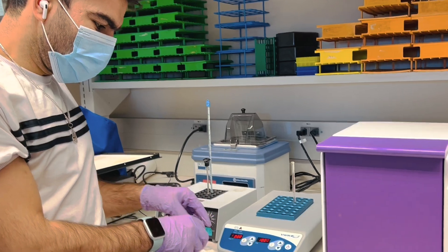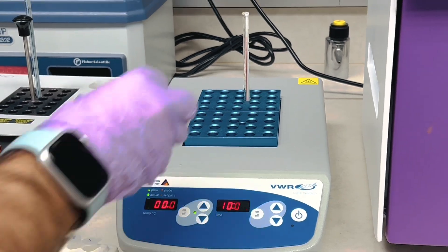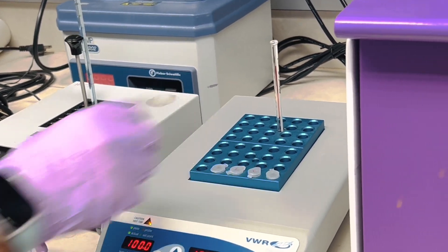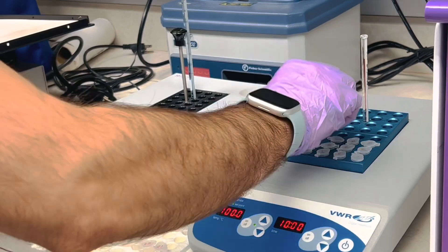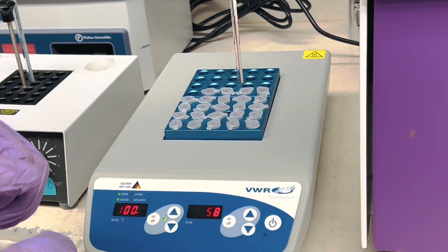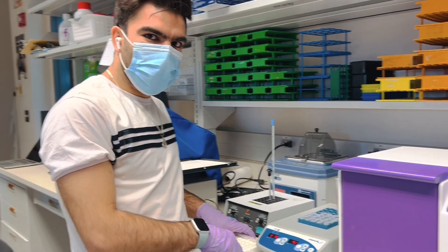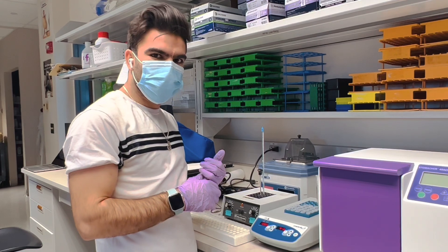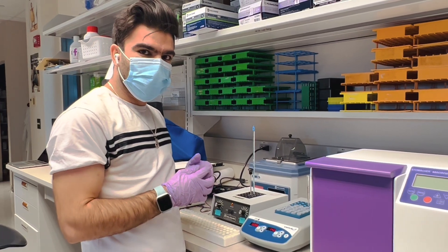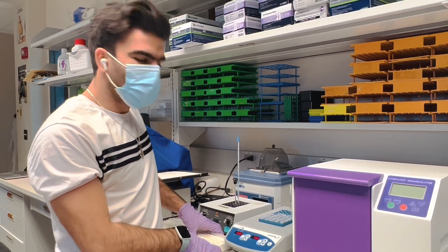Now I need to boil the samples at 100 degrees Celsius. The heating block is already preheated. I'll place my samples in — take care that the plate is already hot. This heating will lyse the bacterial cell wall and cause the nucleic acids to be released so that we can take them for amplification.